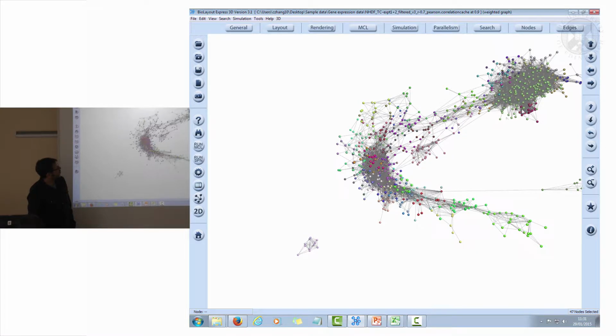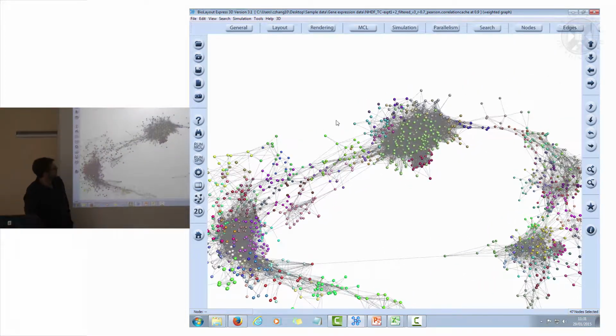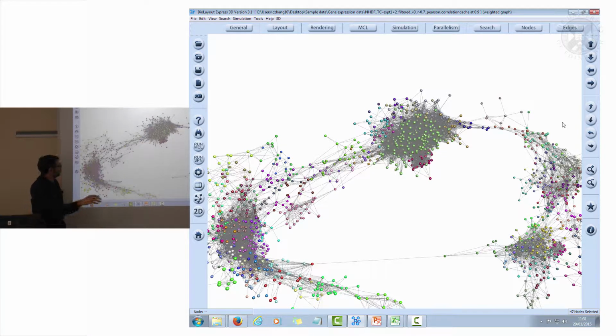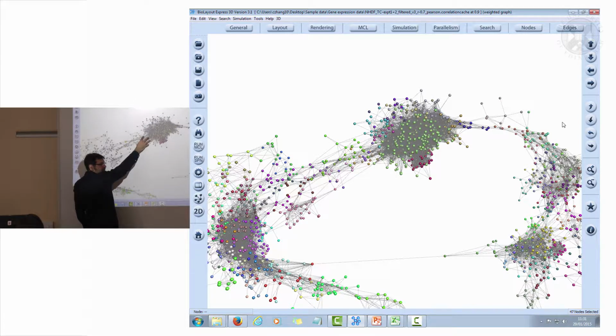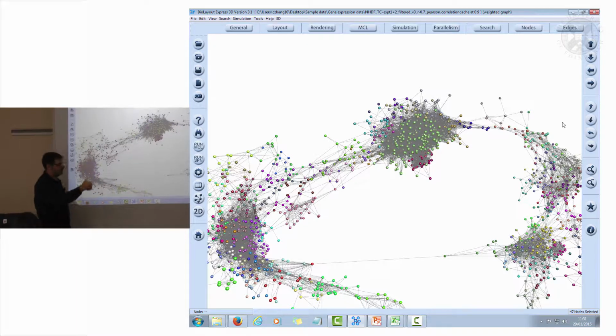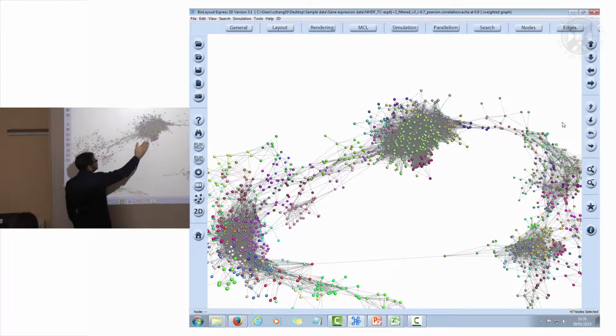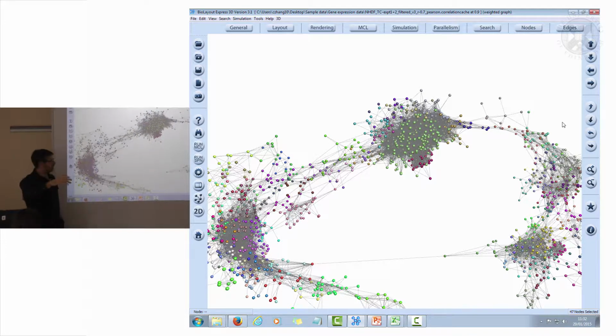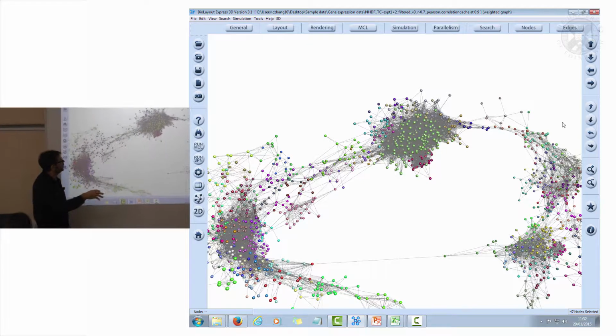It then gets turned off before we go into what we're interested in, which is all of these guys, which are all the genes associated with the cell cycle, so the machinery of the cell cycle. So within here, if you could break it down, it doesn't break down very well as a graph, but here will be your S-phase proteins, so all your polymerases, all the proteins which are required for DNA copying, and then once the cells have copied their DNA, you'll see your G2 and M-phase proteins, which you can't really separate, coming up here, and your histones, which are part of that process, but are actually a bit weird because they go up and down. Their mRNA is not that stable, you see here.